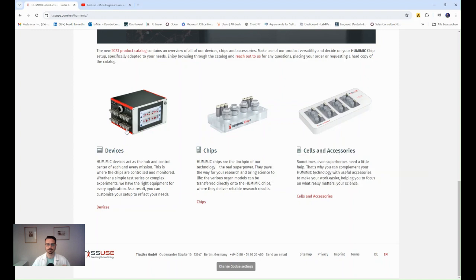In terms of usability and maintenance, they're relatively well designed, so they are not particularly difficult to use. The support is also really good. Obviously, you are dependent on the devices and the kits of the company. So probably they would need to service you really well.